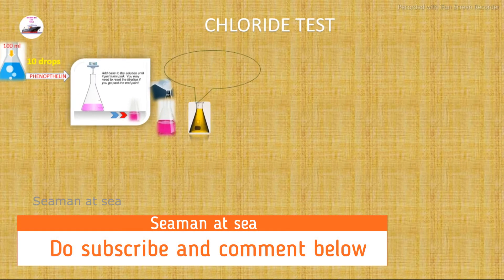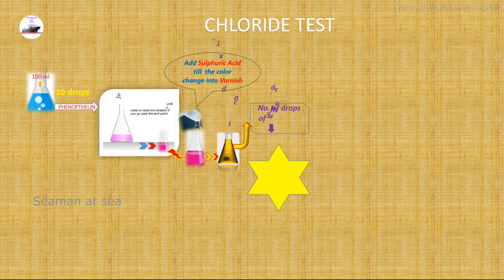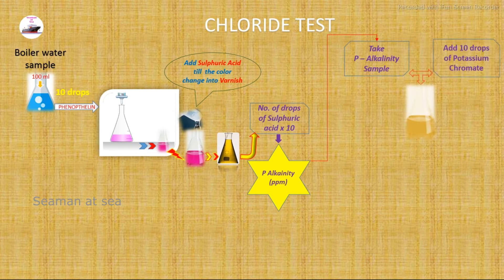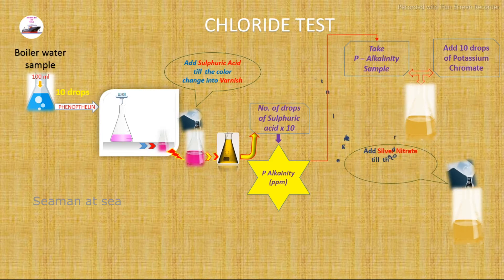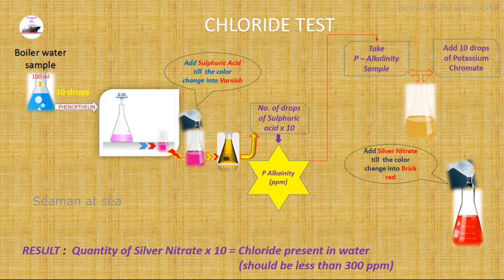Now we will see the chloride test. We use the phenolphthalein alkalinity sample already prepared. We add 10 drops of potassium chromate — the color changes to yellow. Then we add silver nitrate (AgNO₃); the color starts changing to brick red. Once the color changes to brick red, we stop adding silver nitrate. The quantity of silver nitrate multiplied by 10 gives the chloride level, which should be less than 300 ppm.